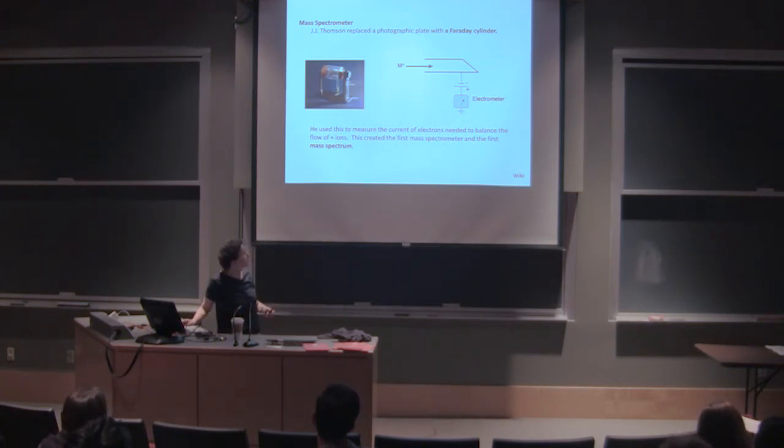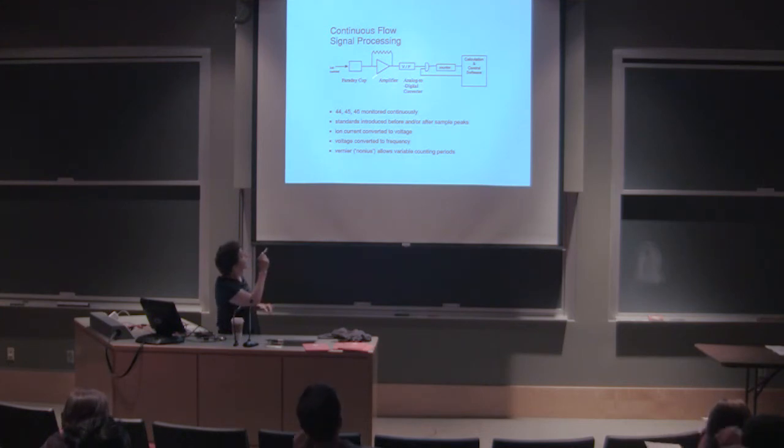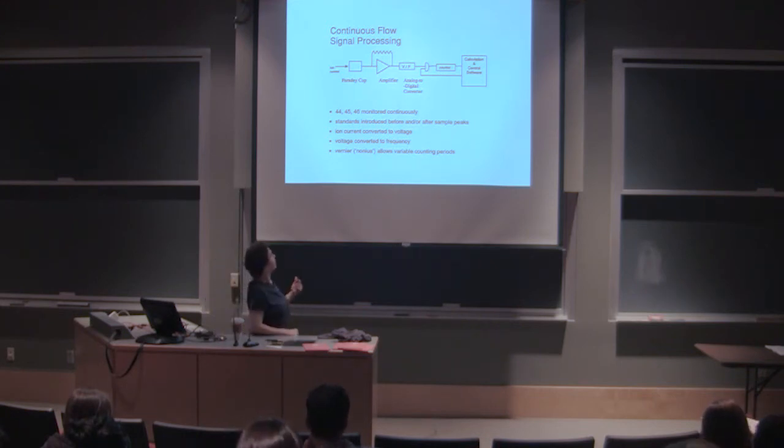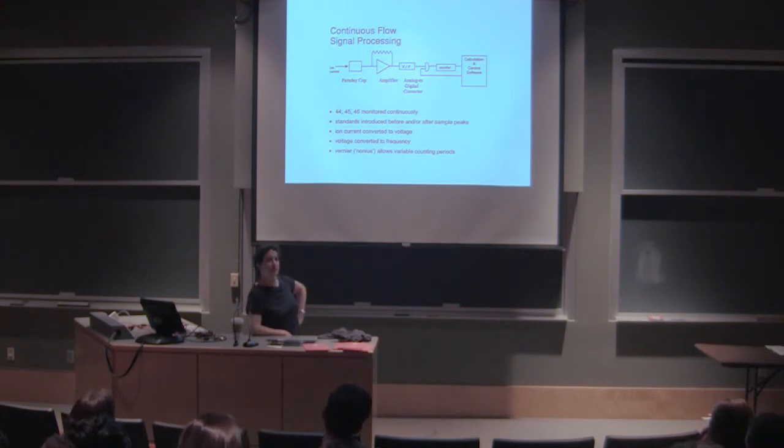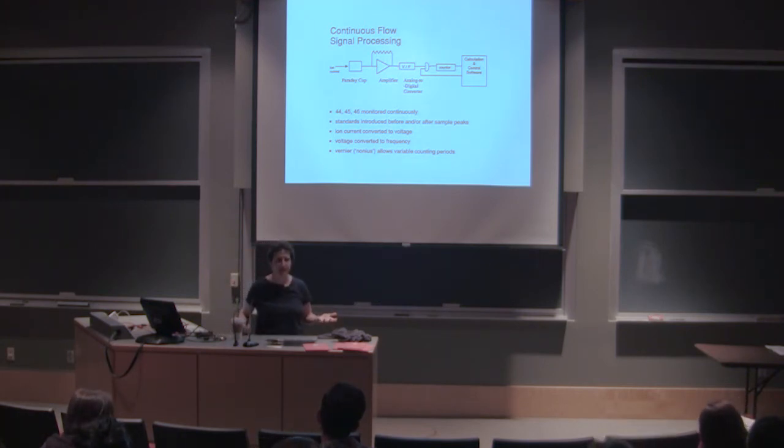So that hasn't changed, but what has changed is how we deal with that incoming information from the flow of electrons. What happens is that the signal is amplified. A current is measured in amps, nanoamps, right? So it's measured in nanoamps. But the Thermo instruments give you your signal in volts, right? So you're actually a step removed from what you're physically doing.